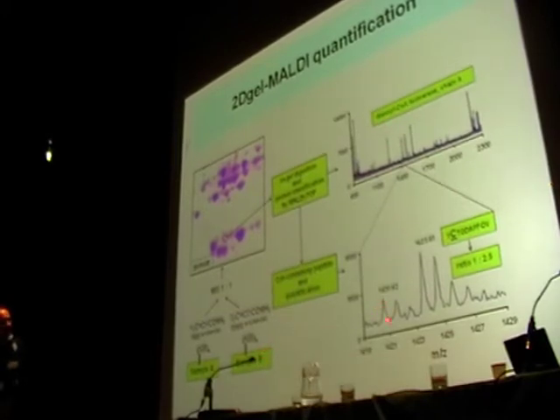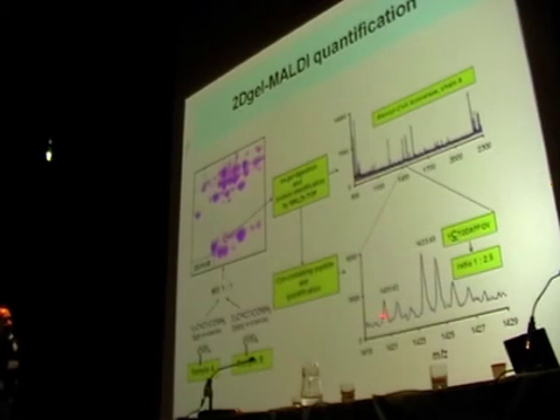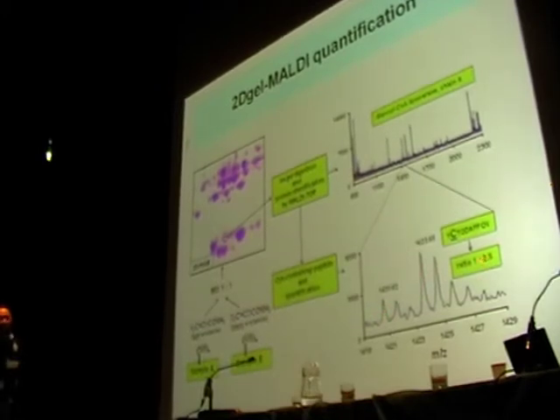And we just take a ratio of the area under the peak, and we see a ratio of 2.5, but we mixed it 1:1. We draw a very simple conclusion that this specific protein was 2.5-fold up regulated in sample B versus sample A. Of course, I may take all of these spots in one experiment, and in one experiment really assess relative quantification of several dozens of proteins.